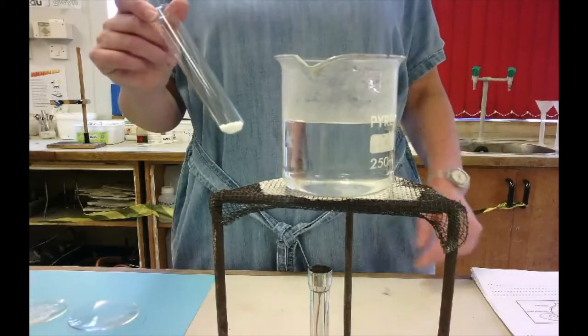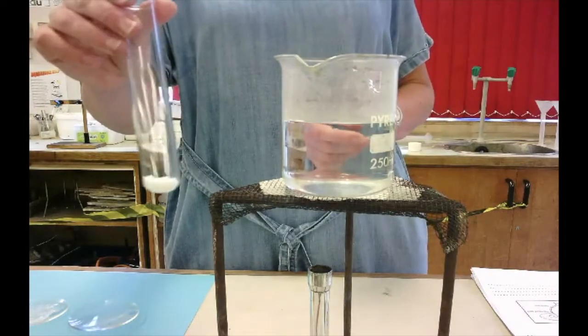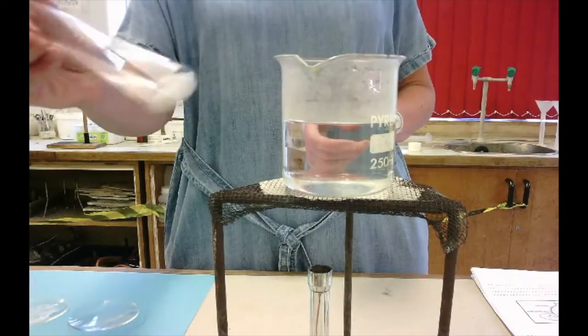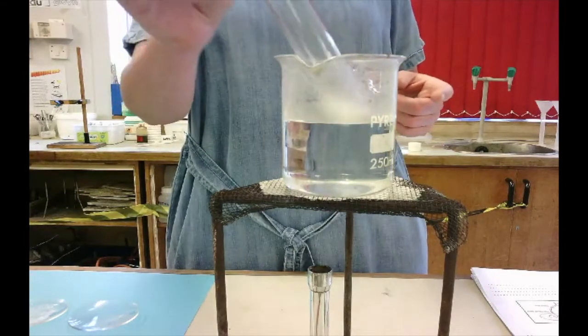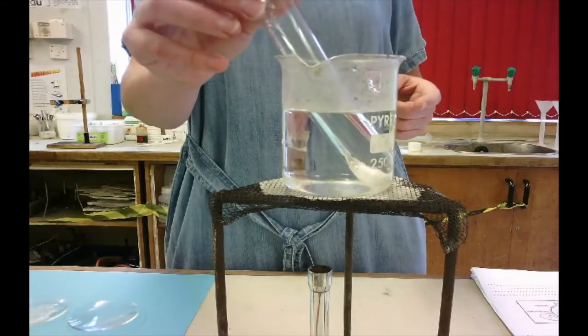Heating things up, cooling things down. I've got here something called salol, which is a white solid. I'm going to put it into a beaker of water. You can see the beaker's hot. I've just put it on top of the Bunsen.